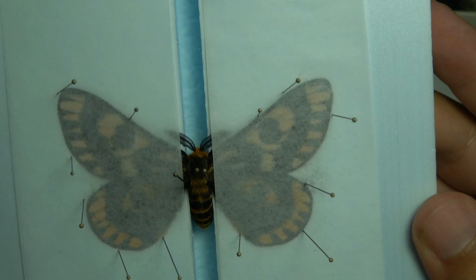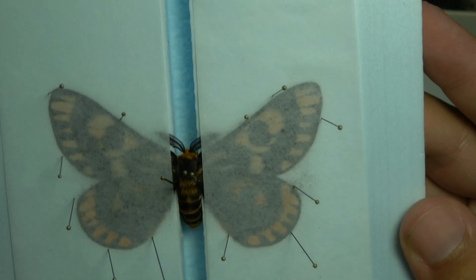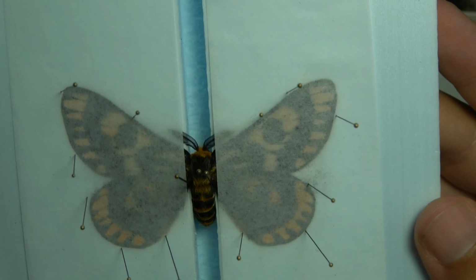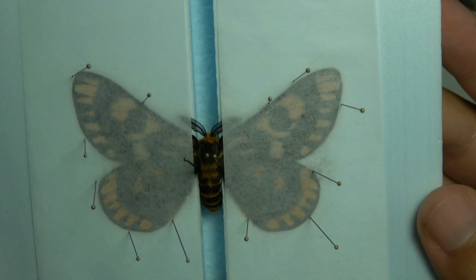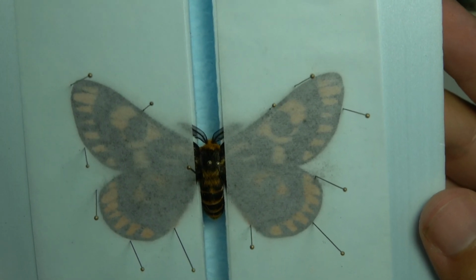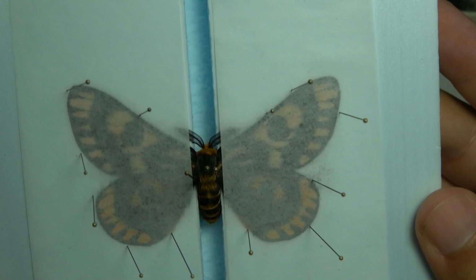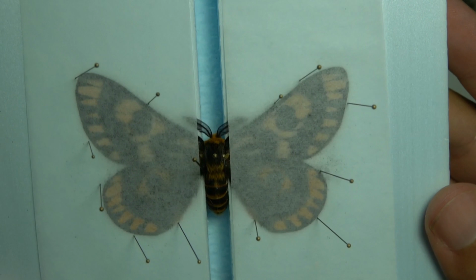With butterflies and moths, you're going to occasionally get specimens that are difficult to spread and don't want to cooperate with you, especially if you're spreading skippers and stuff. So I definitely recommend starting with the larger, common ones to get your process down. And in case you ruin a specimen or two, you won't feel as bad because these species are literally everywhere.